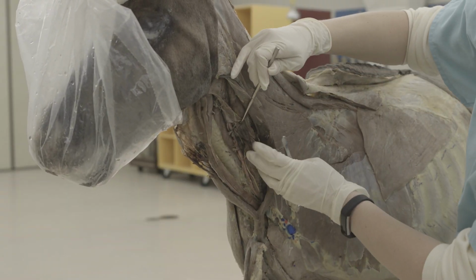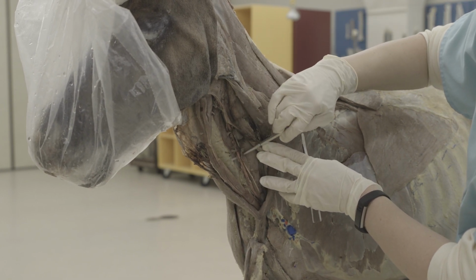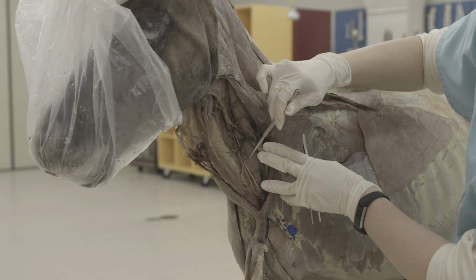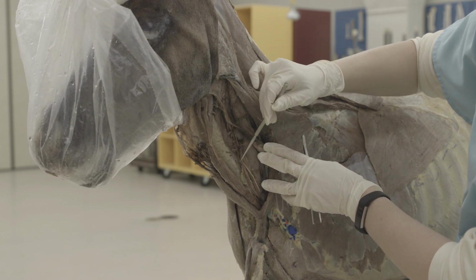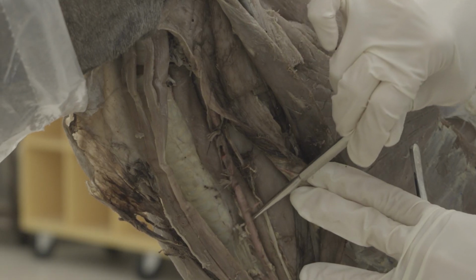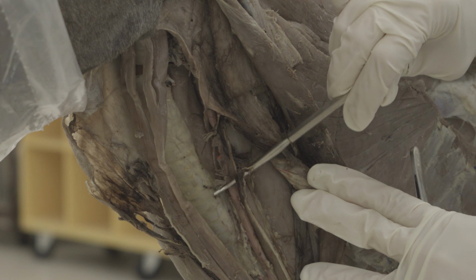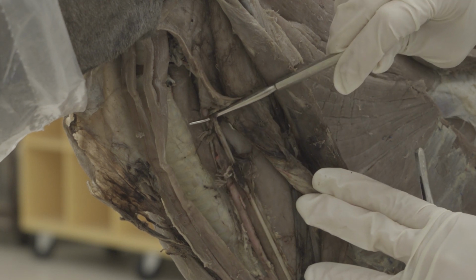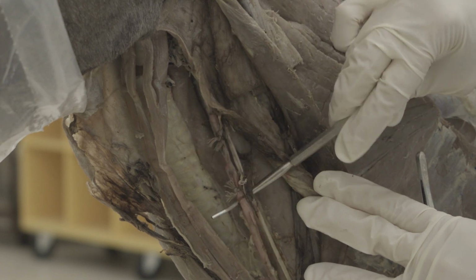Then you also need to look at your carotid sheath. So my carotid sheath is mostly gone because I've dissected it away, but it's that deep fascia that surrounds the carotid artery and the vagosympathetic nerve trunk. So right here you have the left common carotid artery, and then right next to it you have the left vagosympathetic nerve trunk. And those would be in that deep fascia called the carotid sheath.